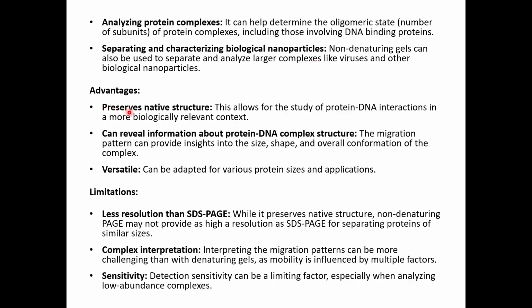So the advantages of non-denaturing gel: preserving native structure. This allows for the study of protein-DNA interactions in a more biologically relevant context, and can also reveal information about protein-DNA complex structure, that is, the migration pattern can provide insights into the size, shape, and overall conformation of the complex.